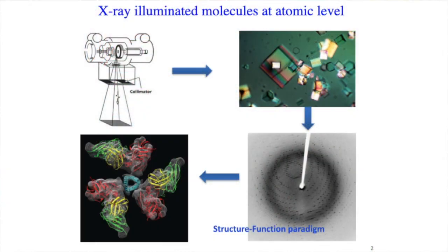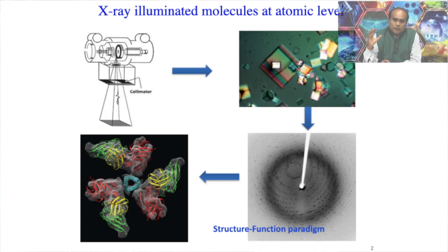So, in this lecture we are going to discuss how NMR spectroscopy can be used for elucidation of higher order structure, which includes secondary, tertiary and quaternary structure of protein. Over the years, X-ray crystallography has predominantly been used as a structural tool and it has dominated the structural biology field for many years.